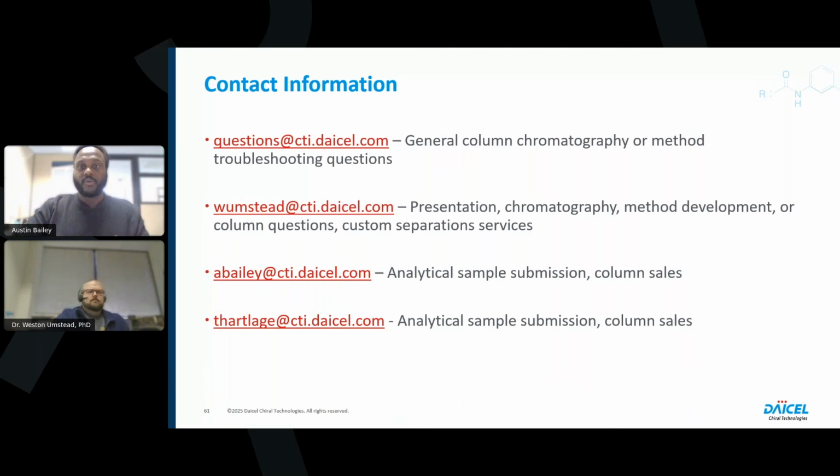He is saying we currently purchased a 4 mm by 100 mm, 5-micron L108 packing Chiralpak CBH column with the column guard, using it to analyze their final product, which is 2% lidocaine and 1 to 200,000 epinephrine, mostly water and salt, pH right around 4, and our raw material API epinephrine bitartrate. We are following a USP method for epinephrine bitartrate.